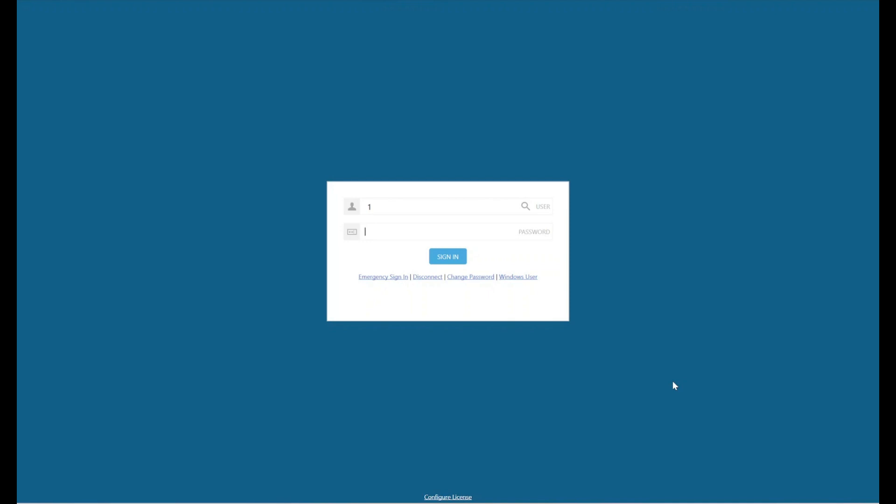Now, I've gone through and done the setup that is required before you get to this because it's not particularly interactive, but I will do a video that more comprehensively describes how our 21 CFR GXP compliance solution works and how you would set that up. But for the moment, we're going to go into it as if it's already been set up.